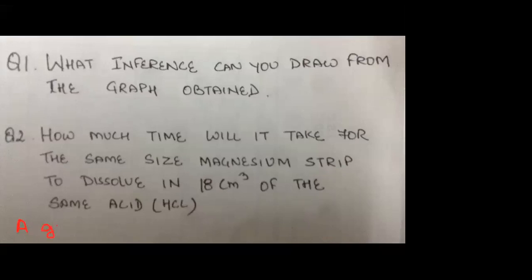of volume of undiluted acid versus the time in seconds should be attached.